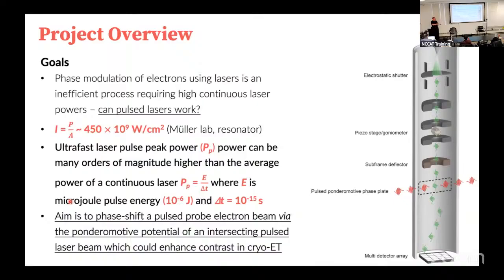Lasers are not particularly strong, and if you want to develop really strong, really powerful lasers, then you get into challenges of safety. How are you going to be able to align the thing? How are you going to be able to not blow a hole in the wall?